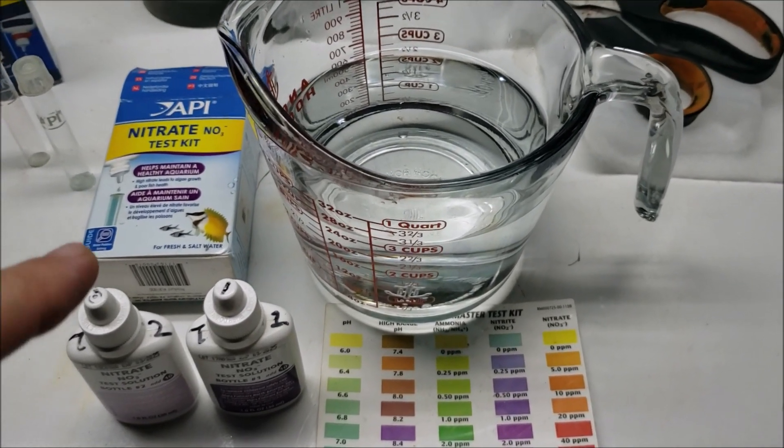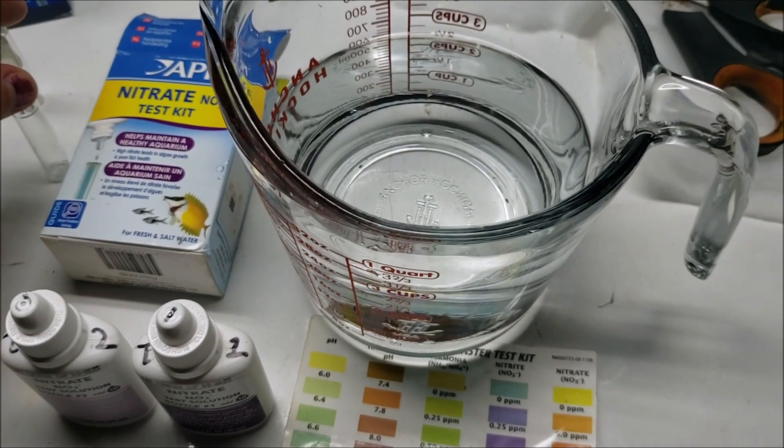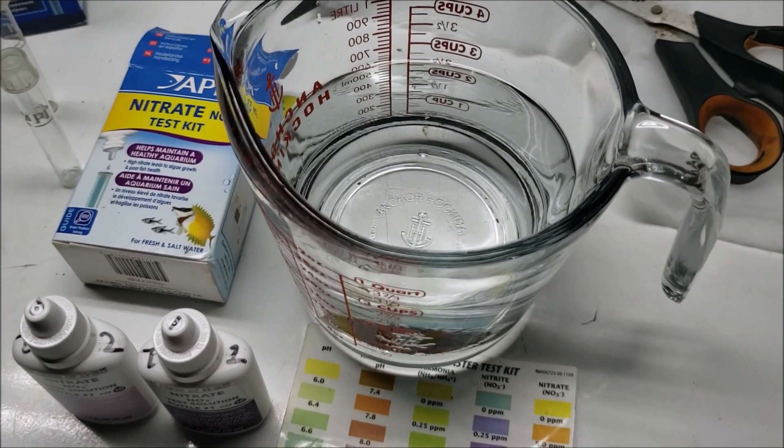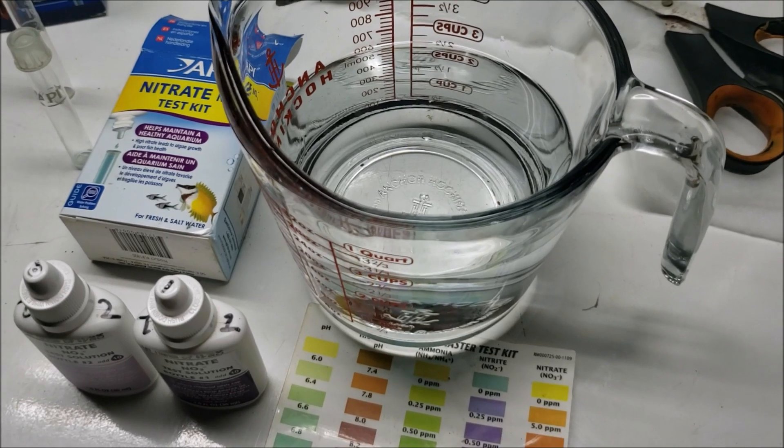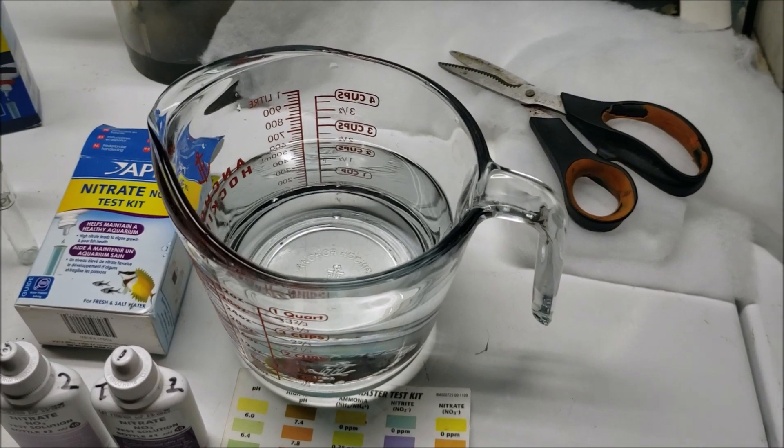What we're going to do today is a nitrate test on my tap water. You can see how crystal clear it is. We'll get a result that'll be nice and yellow because there's no nitrate in it whatsoever, so we'll have an established amount. Then we are going to artificially stain the water with some tannin.